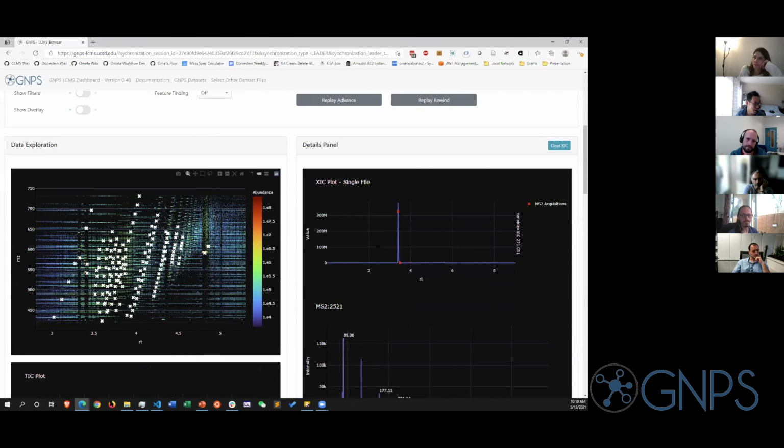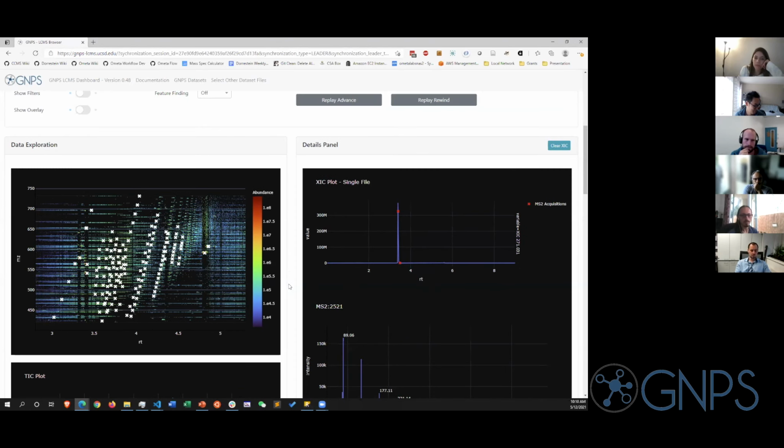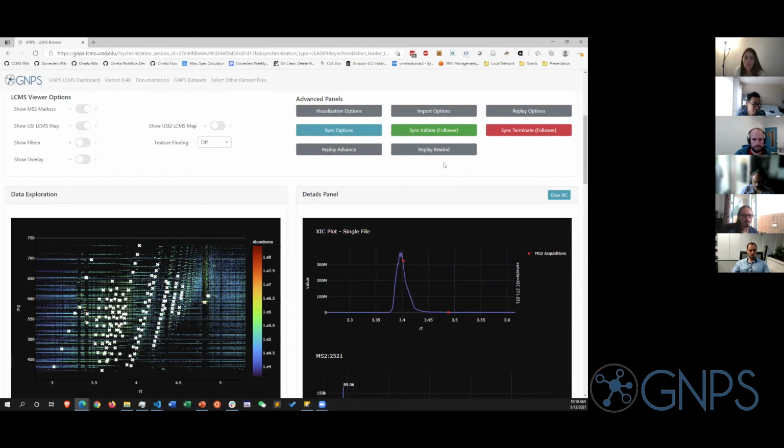But going back to the heat map, I think we should highlight that dark mode is generally not preferred for journals. So I agree with Ming. It's easier to inspect the data and you can get visually a higher dynamic range, but journals in general do not like dark backgrounds. If you were to go to a Nature journals or Cell journals type paper, they generally will ask you to convert a black background back to a white background. Yeah, that's a great point. So again, you can change all of these things about it.